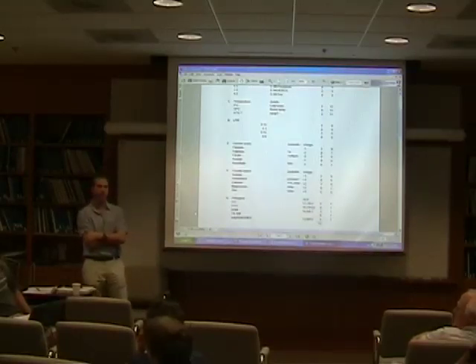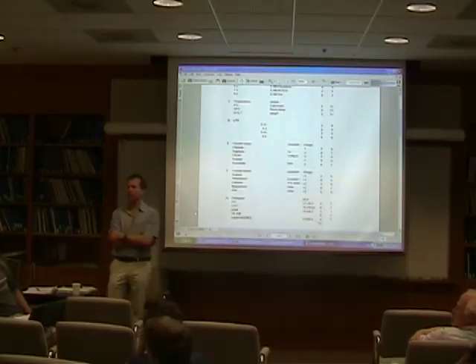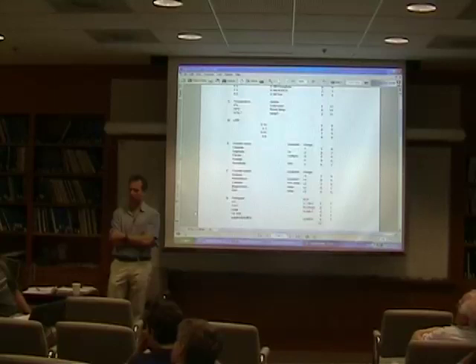It doesn't mean that the protein is homogeneously in all of the liposomes at the same lipid to protein ratio among the population of liposomes, but it means that the protein has been reconstituted. Otherwise, we don't.